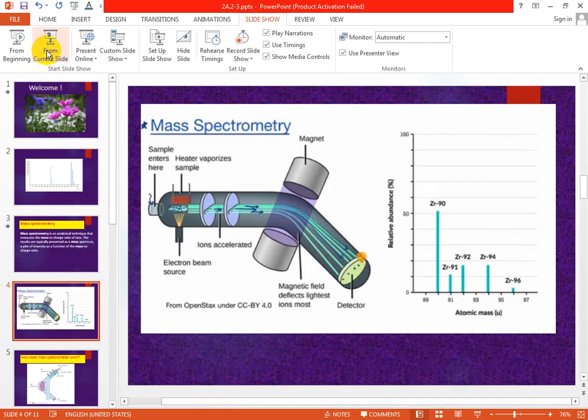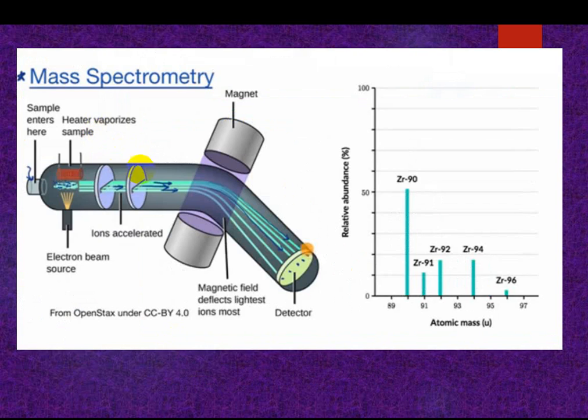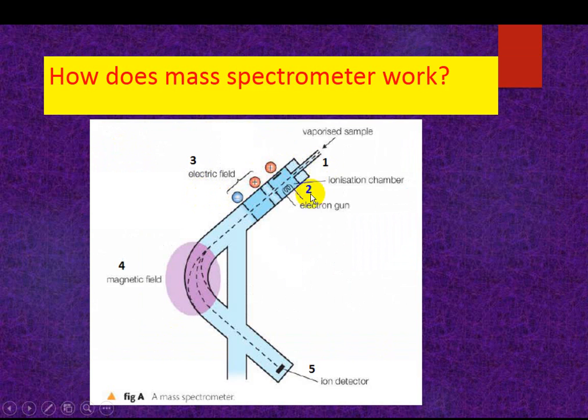Okay, next thing is, how does a mass spectrometer work? You know this thing already.